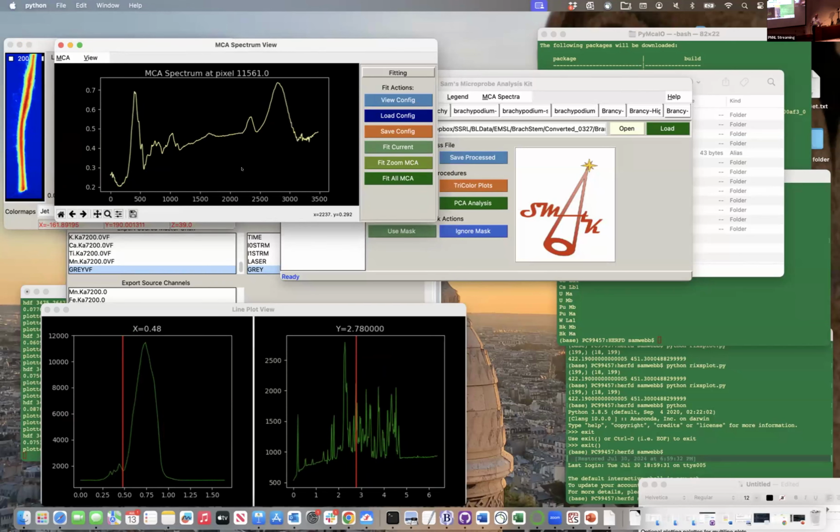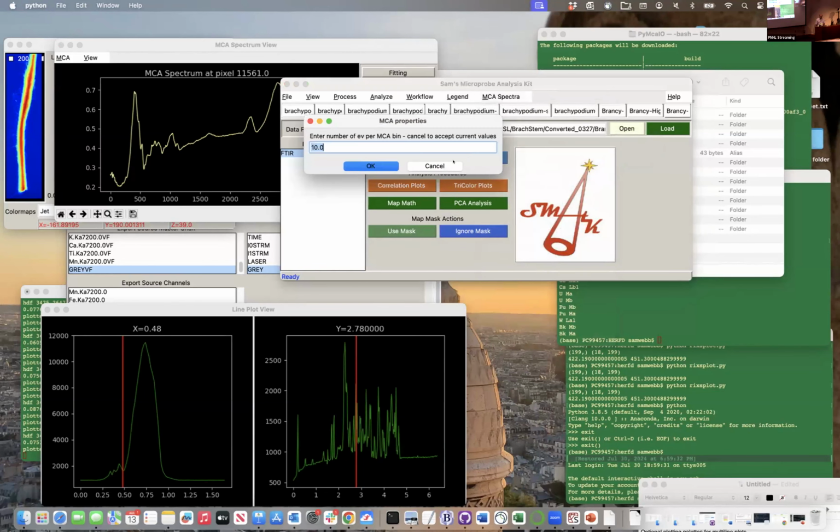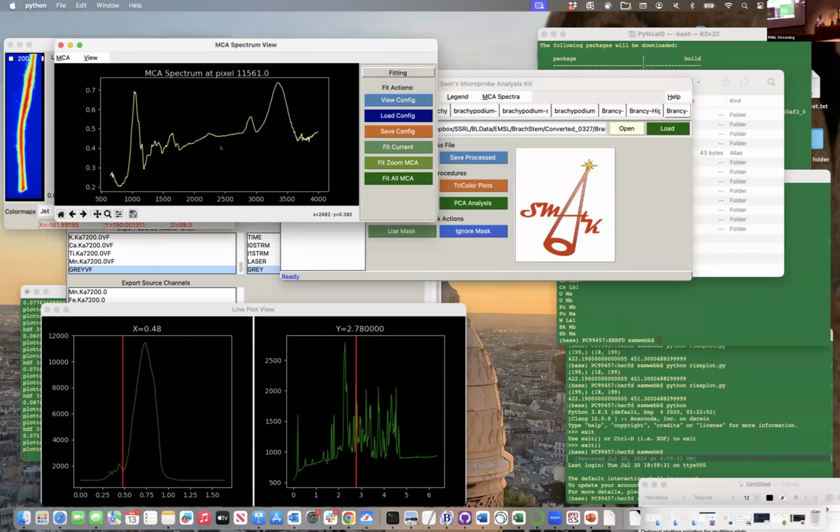This is also now looking at it in bin. That's my default, and that's not very useful. It doesn't have any real information. Luckily, almost everyone's files have that information. So if I say look at this in a spectrum way, and I cancel to accept the values in the file, now this shifts to wave number. This is the same thing you do with mass spec data. You change to spectrum, and it will change it into mass to charge instead of wave number.